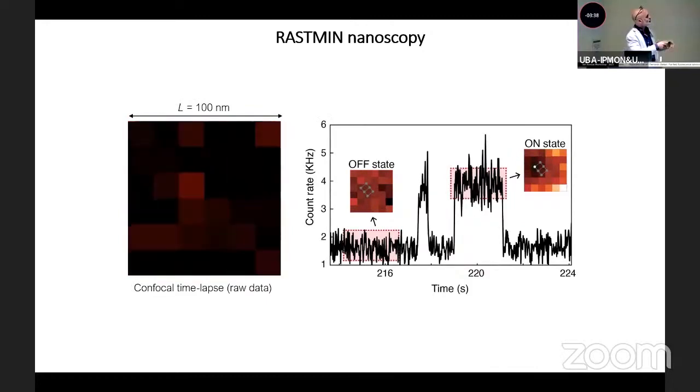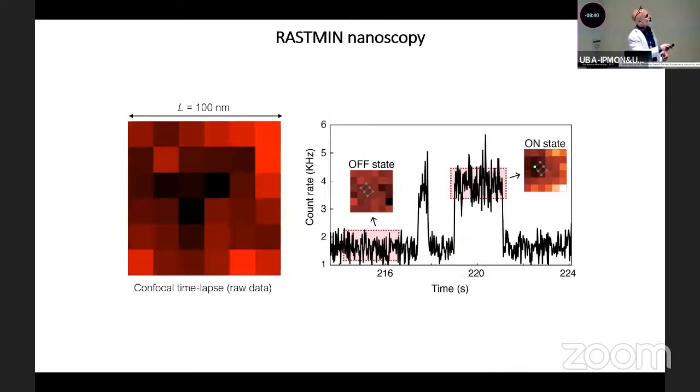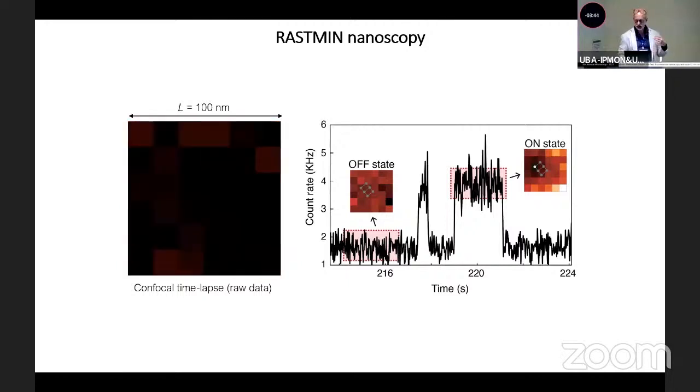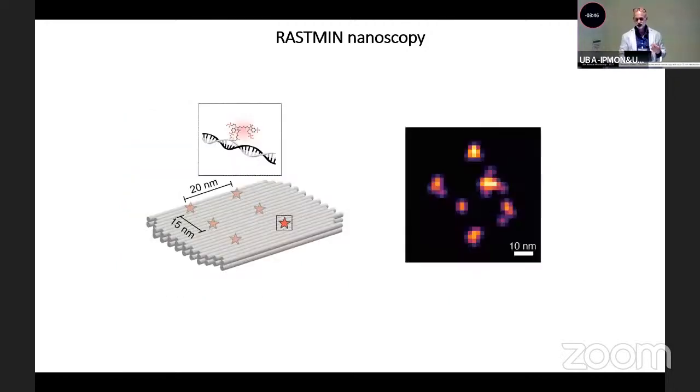And eventually one molecule blinks, and we see a minimum, and we determine its position by maximum likelihood. And like this, we collect positions. After a while, we can render a histogram of positions that looks like this. And we really retrieve the geometry where the molecules were, again, with a scale of about 10 nanometers. And this is done now on any scanning microscope, okay? You don't need a very specialized microscope.